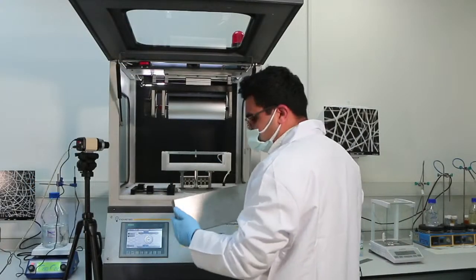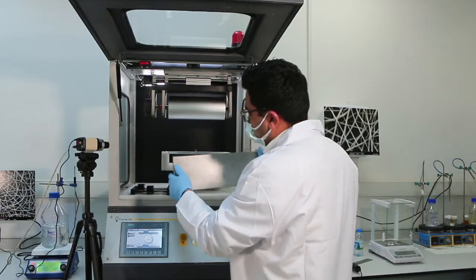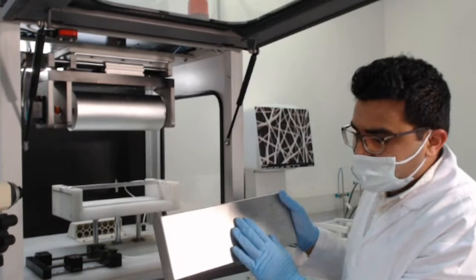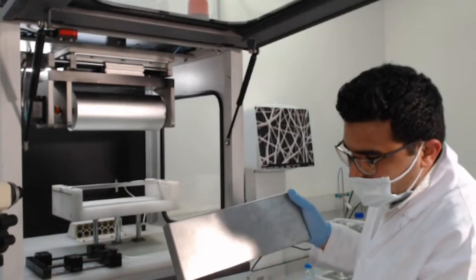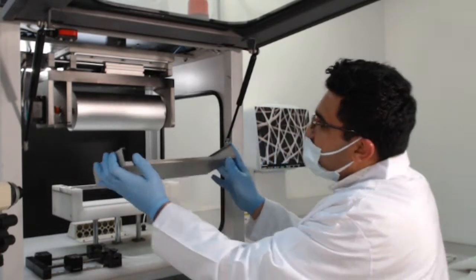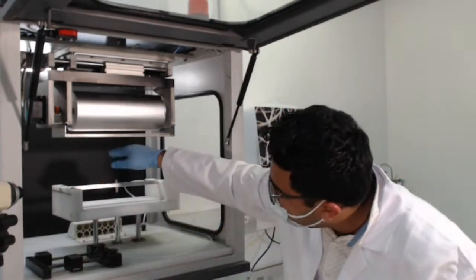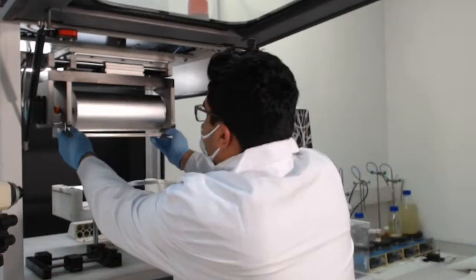Alternatively, if you want a flat collector, it is also possible to put that in the machine. This is for random nanofibers, if you don't want the nanofibers to be aligned. It's for that mesh. You can place it similarly, and it'll produce nanofibers on top.